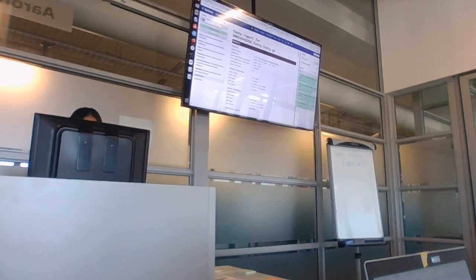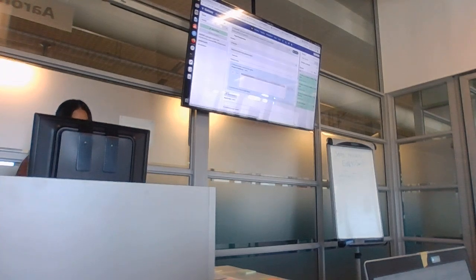search for MultiQC, and you will see it says aggregate the results, and you have to choose.